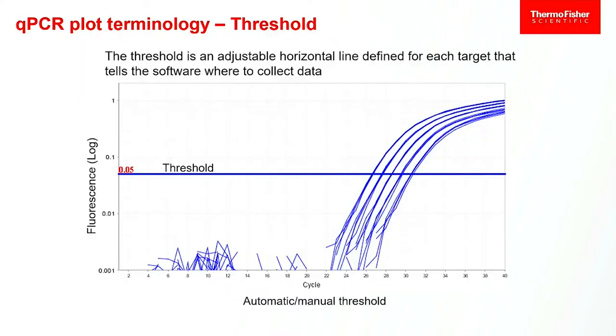It's a little counterintuitive to everything else that we measure in the lab, and it's why in our table it looks like the smaller number had more stuff, but the smaller number does have more stuff. That's how it's defined. One of the mental hurdles we have to go through when we learn this technology is that everything we think we know is kind of turned upside down.